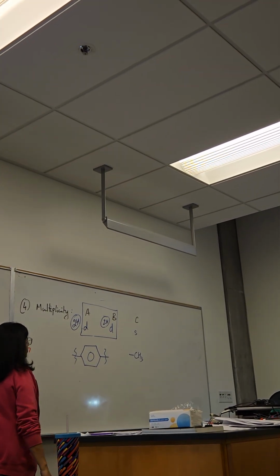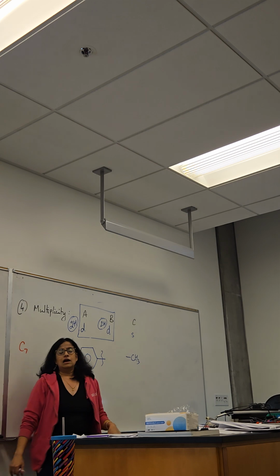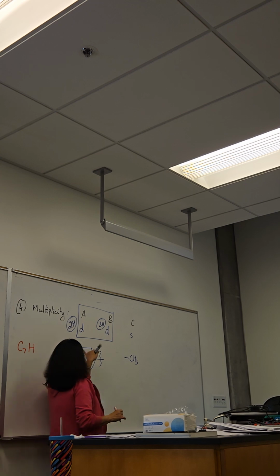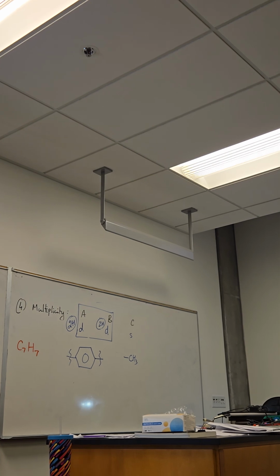Wouldn't it be 6? Why? Well, no, 1, 2, 3, 4, 5, 6, 7. Oh, my bad. How many hydrogens have we accounted for in these 2 pieces only? 7. 1, 2, 3, 4, 5, 6, 7. What's left? The oxygen and bromine.